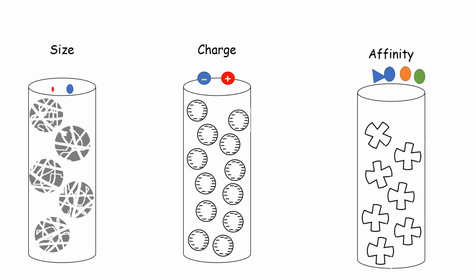Because the target protein we need for crystallization is not the only protein produced, we must purify the protein. There are many different ways to purify a protein. The three main types are size exclusion, ion exchange, or affinity chromatography. For example, we can separate proteins by size.